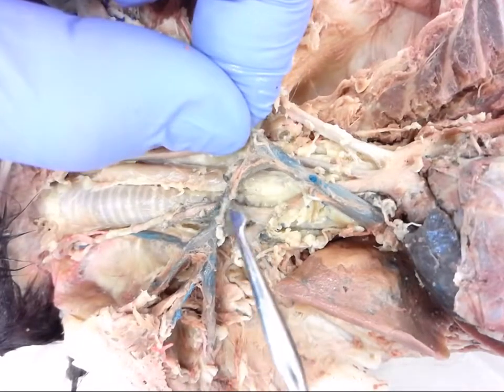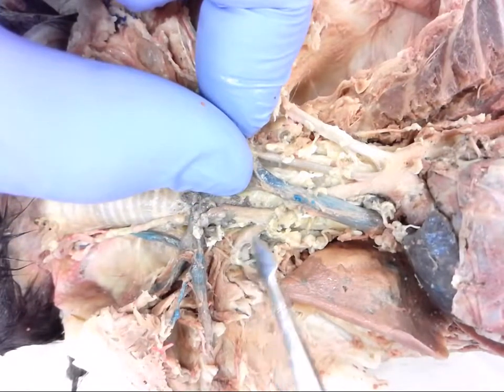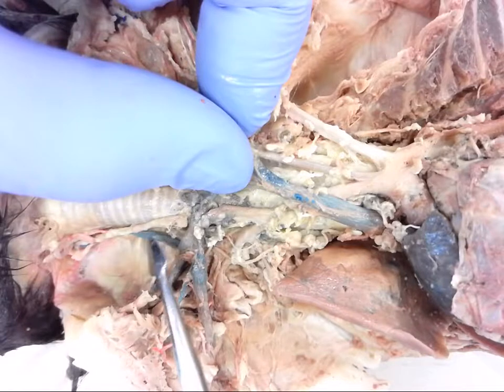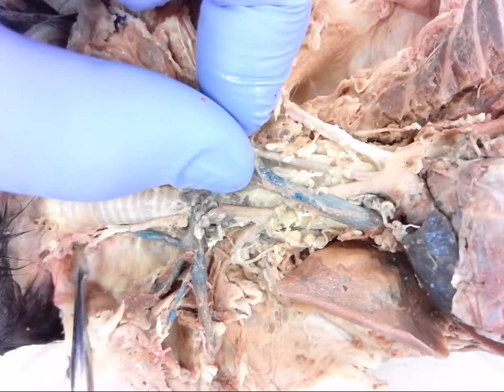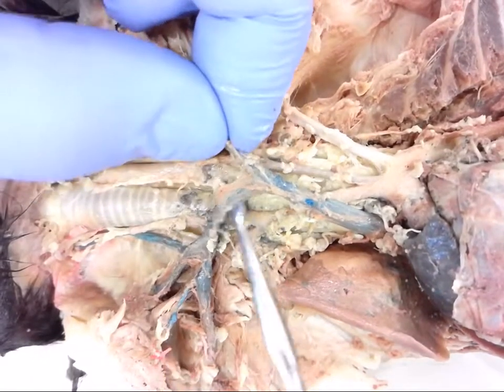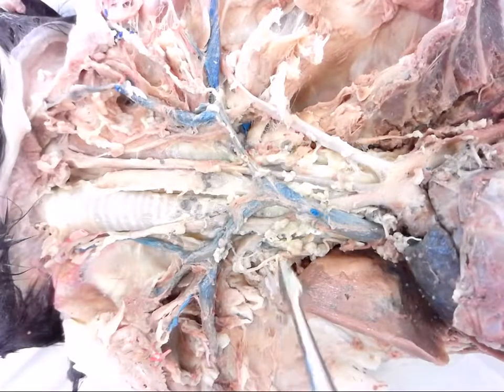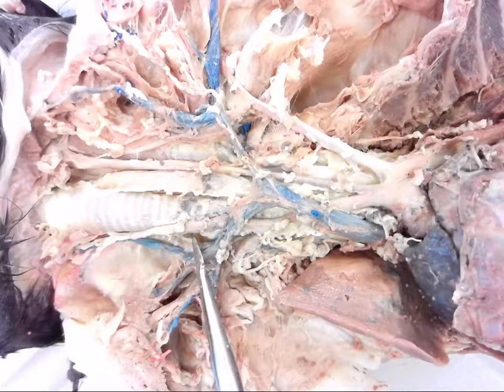This is not the best specimen because the latex hasn't filled it completely, and you'll find that yours may have a little bit better latex filling in it. And then the left common carotid is going to go up toward the neck. You'll see that up here it has actually been cut a little bit, and there's some latex that you can see there. Okay. So there is the blood supply going out to the right arm and up to the head in both of your common carotids.